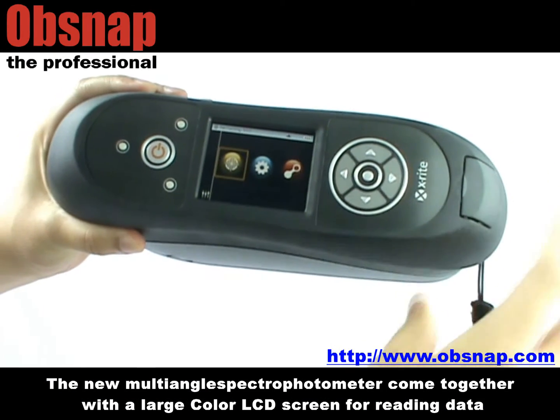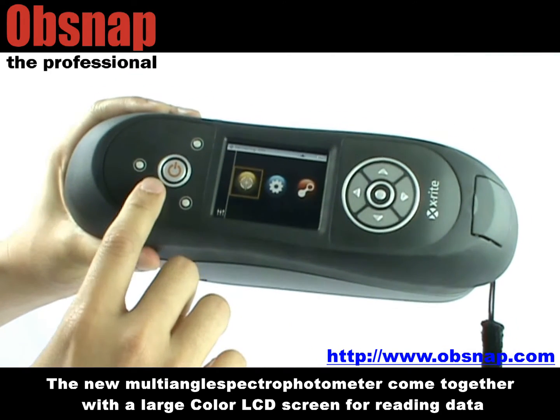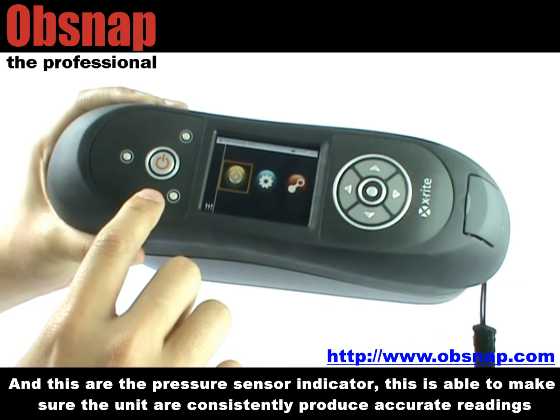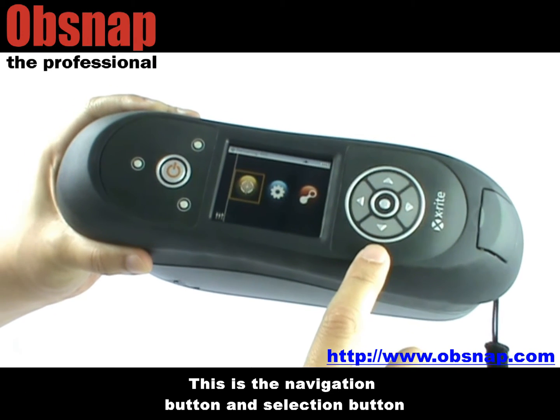The new multi-angle spectrophotometer comes together with a large color LCD screen for reading data. This is a power button, and these are the pressure sensor indicators, which are able to make sure the units consistently produce accurate readings. This is the navigation button and the selection button.